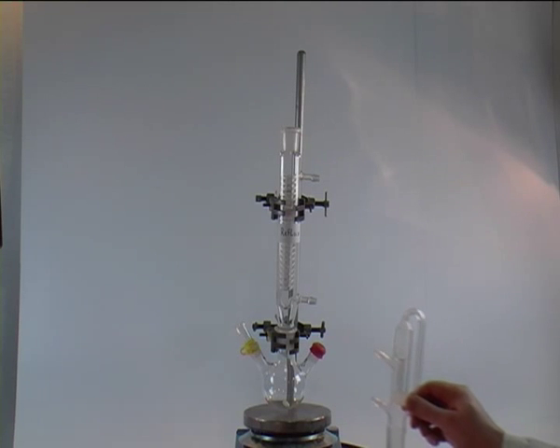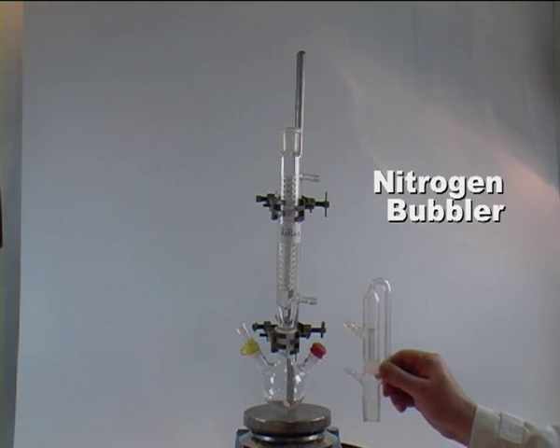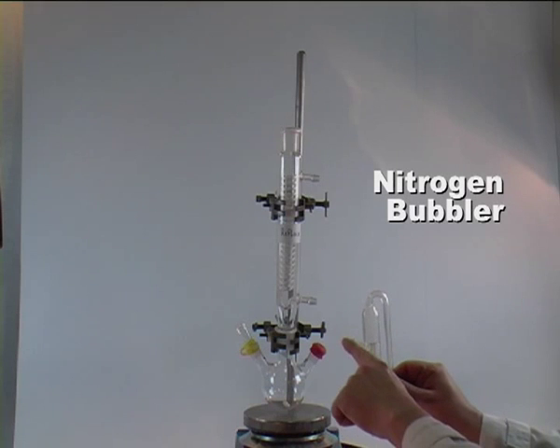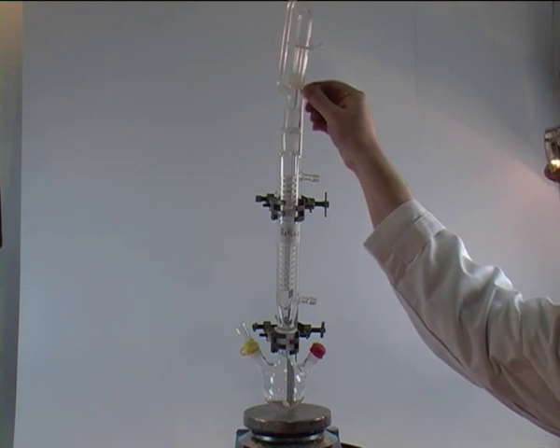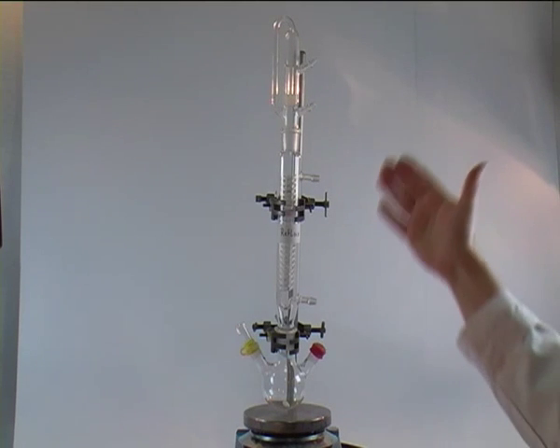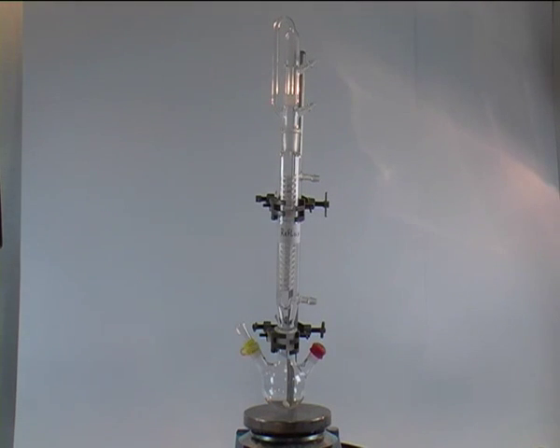The final piece of equipment is our nitrogen bubbler, where we have a nitrogen inlet at the bottom and a nitrogen outlet at the top. We put that on top of the reflux condenser. And in this way, this whole apparatus setup is sealed airtight.